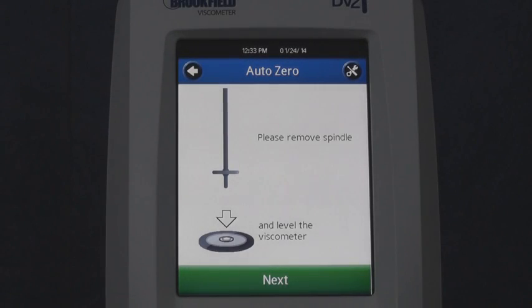You then want to test the viscometer to ensure that the screen protector was applied properly. If done properly, the DV2T viscometer will respond when you press the touch screen.